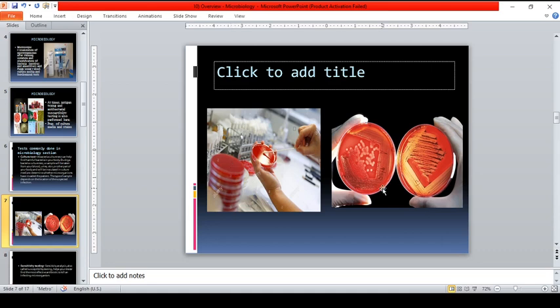Okay? So, this one is positive for growth of bacteria, and actually, that is already a heavy growth. Okay? Heavy growth, marami. Meron kasi tayong light growth, medium, and heavy growth of bacteria. Okay? So, this is a culture media with a heavy growth.